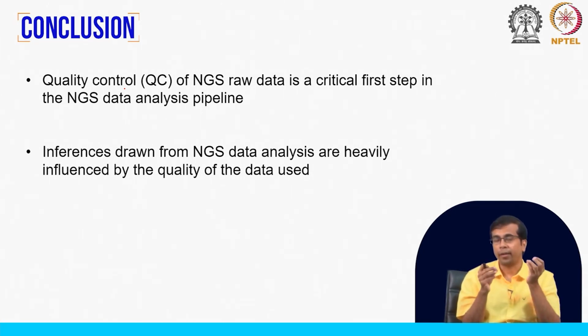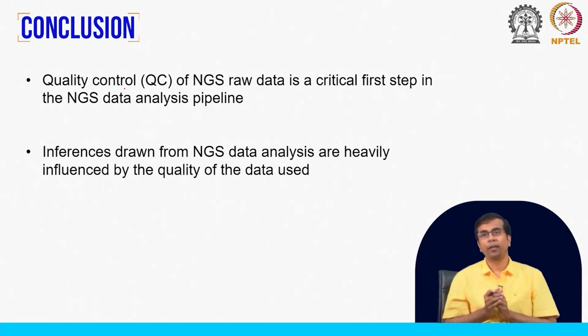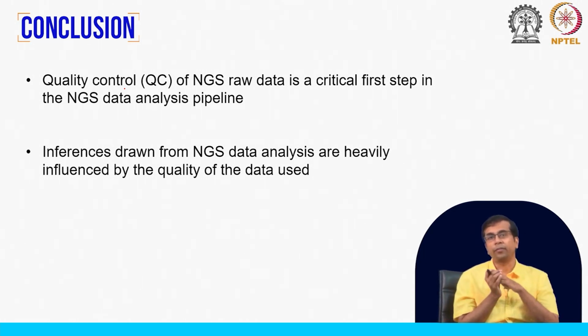I can give you an example. For example, we can take single nucleotide polymorphism detection. This is something that is very important. For example, we are screening patient samples. We are looking for mutations in a gene or maybe a few genes, which might tell us whether that patient will respond to a certain treatment or not.